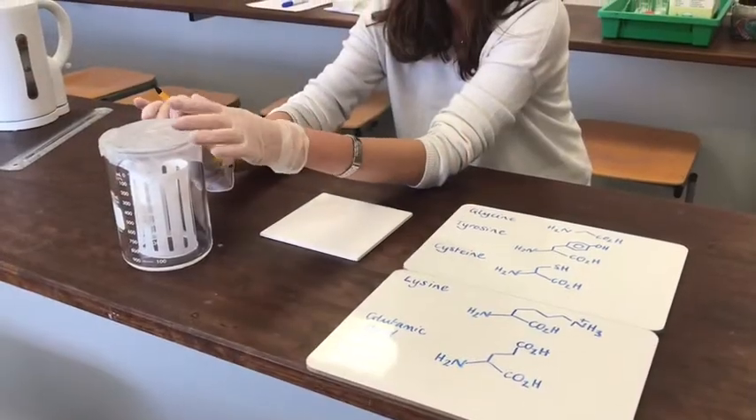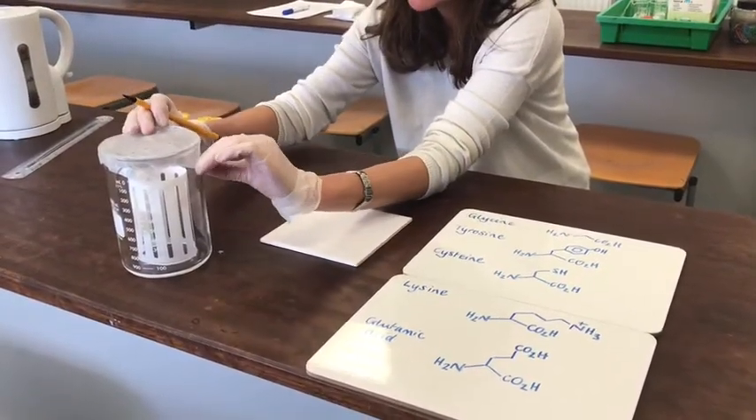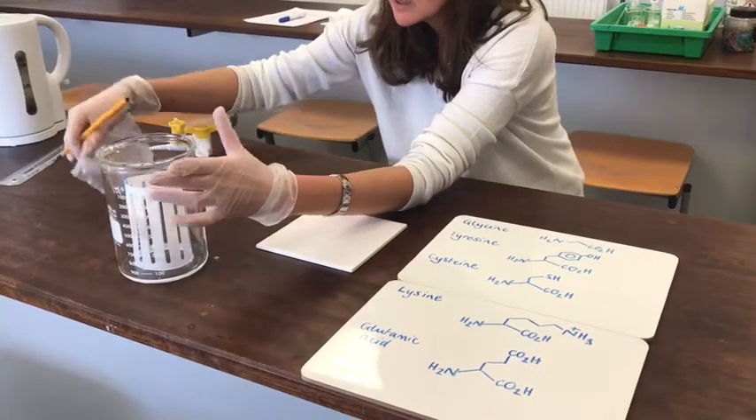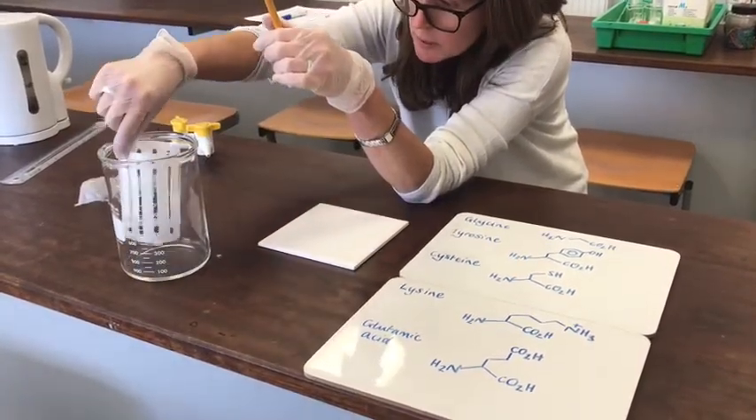It's time now to take this out of the development chamber. I'm going to very carefully remove it, and I've got to mark on where the solvent comes to, so I can see the solvent front. That's quite tricky, because it's quite difficult to see where it's soaked up to, so I'll be doing my best to do that.